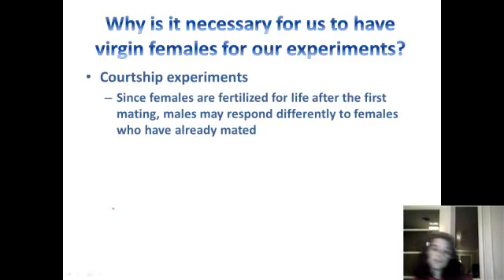Again, why do we need these virgin females? Well, for our courtship experiments, since it's so important for males to be the first to fertilize, it may very well be that they respond differently to a female that is a virgin versus one that has already been fertilized. Then again, maybe they don't, but maybe that's an experiment we could run. But suffice it to say that it might likely be an affecting factor.